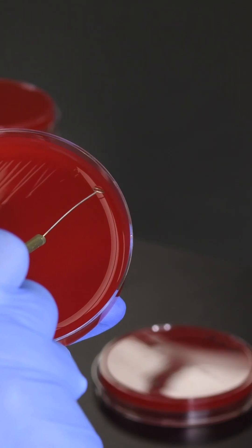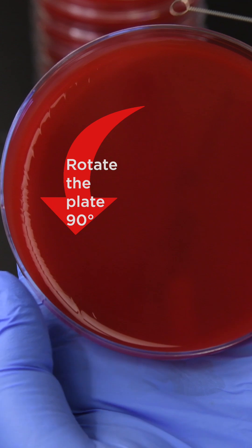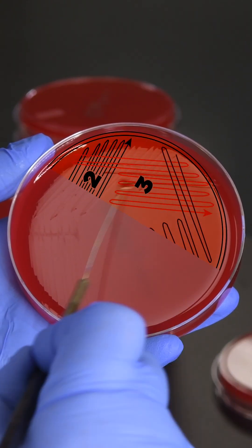Re-sterilize and cool the loop in the agar. Rotate the plate another 90 degrees and spread the cells from quadrant two into quadrant three.